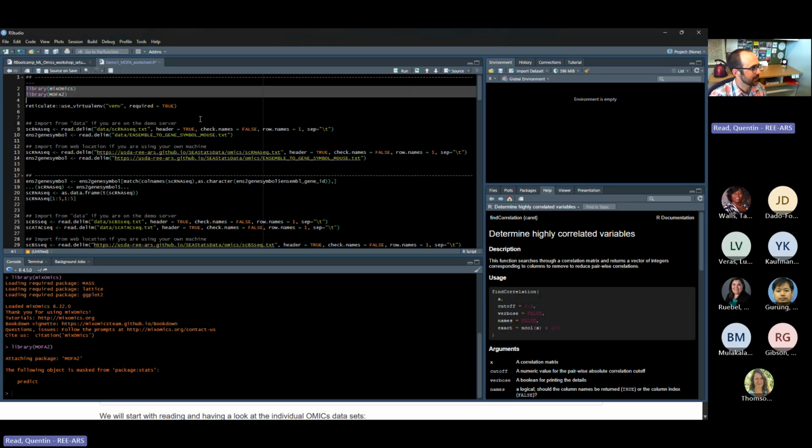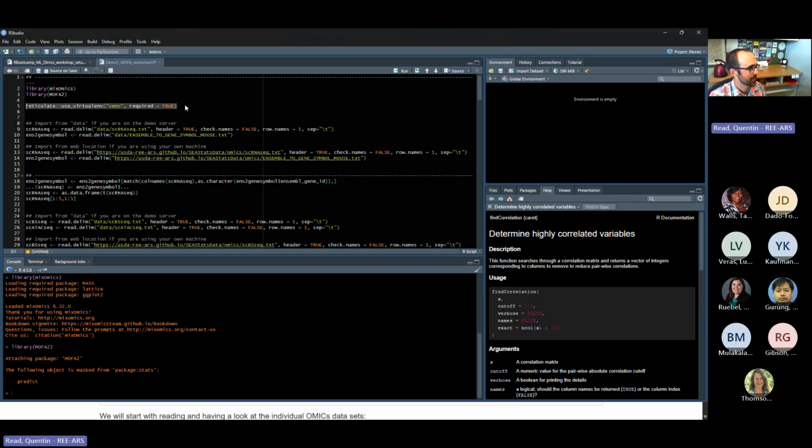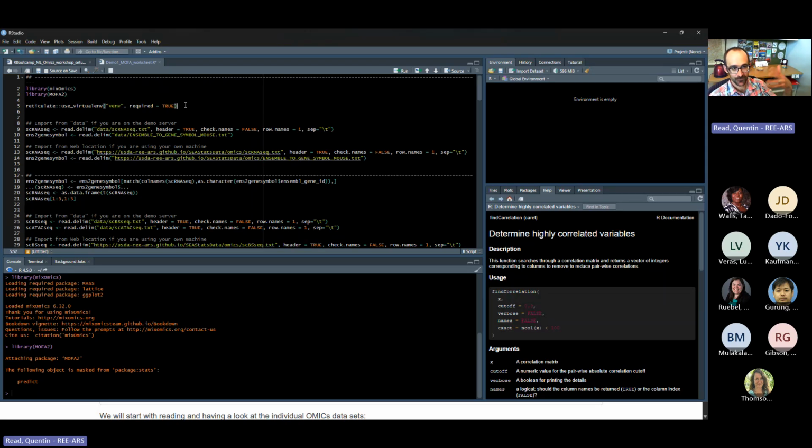And now this line here, you should not run. Skip that line, because I figured out a better way to get everything to run that does not require that, but I forgot to remove it from the worksheet yesterday when I was updating everything. Okay. Yeah, but please speak up or put in the chat if you have any problems right now, since Grant is not here at the moment to help out.